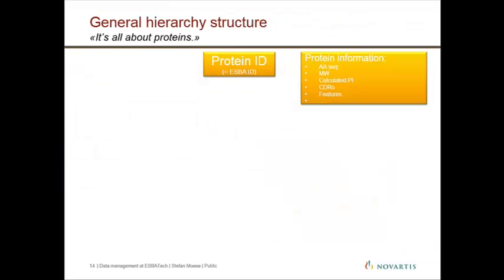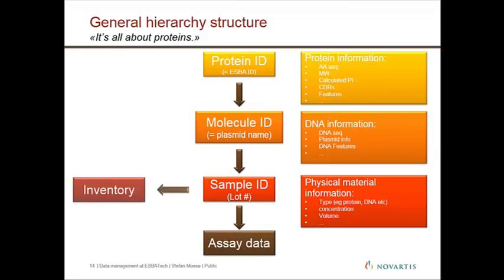And what we had to think about is what is the highest level in the hierarchy that we needed, and because we're working with therapeutic proteins and antibodies, the protein is the highest level of hierarchy. I don't want to bore you to death with all the different details, but what we've decided is that we needed several hierarchy levels.